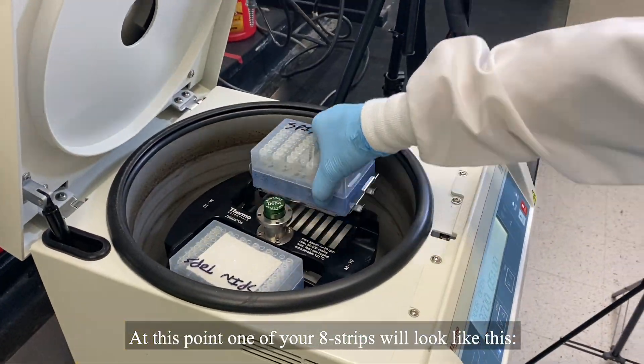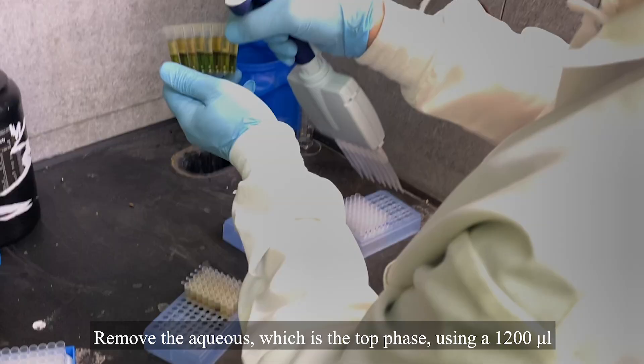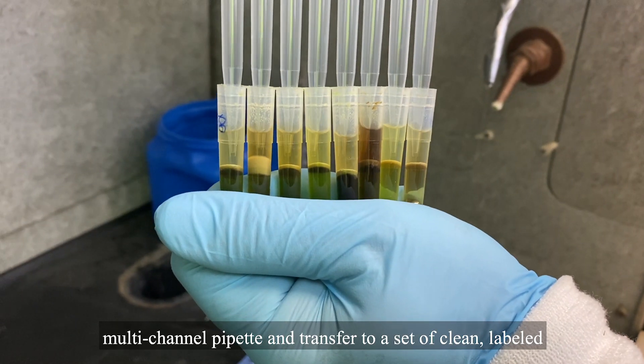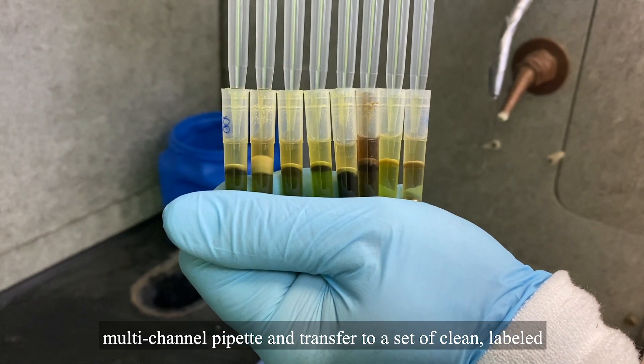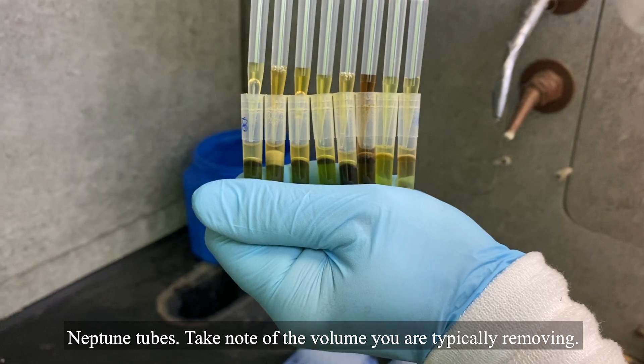At this point, one of your eight strip tubes will look like this. Remove the aqueous, which is the top phase, using a 1200 microliter multi-channel pipette, and transfer it to a set of clean, labeled Neptune tubes. Take note of the volume you're typically removing.